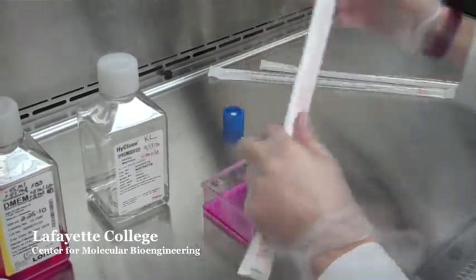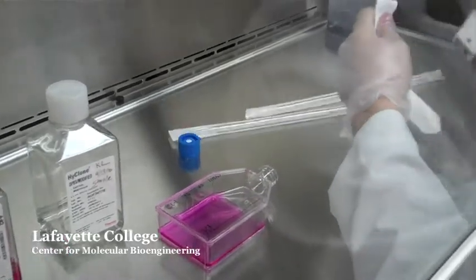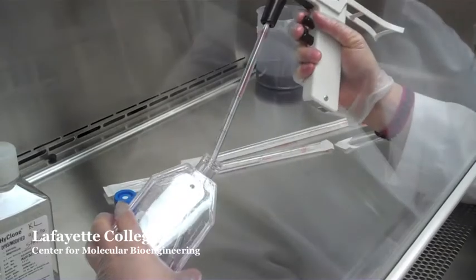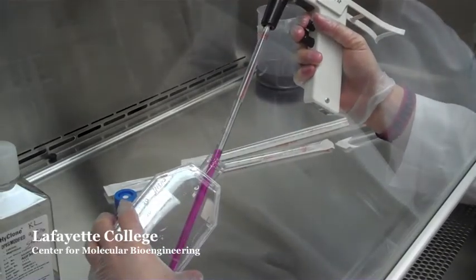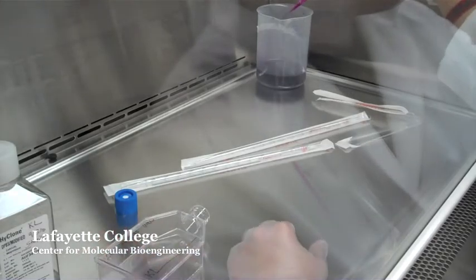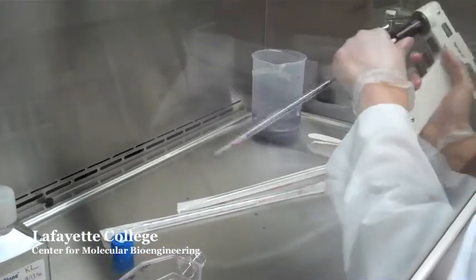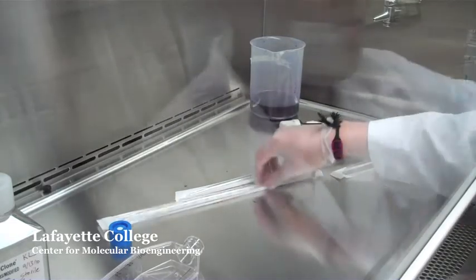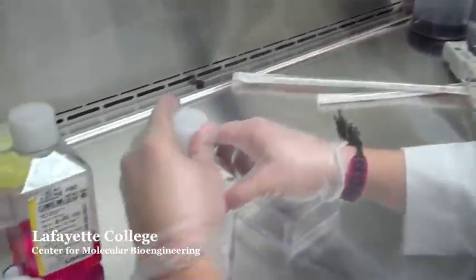Aspirate the media in the flask using a 10 mil pipette and discard into the waste beaker. Change the pipette so that you are using a clean pipette to rinse the flask with PBS.